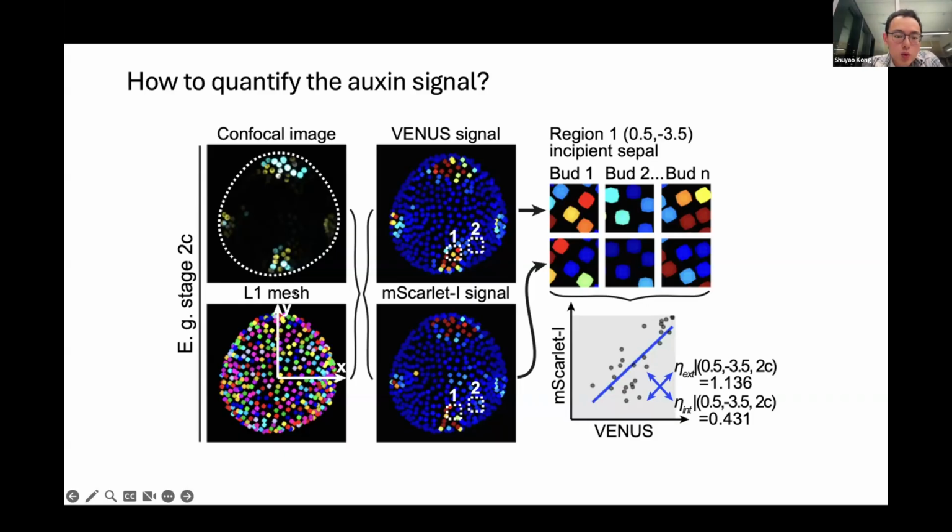You can see here each nucleus is labeled by a little ball, which is a mesh in MorphoGraphX. How we did that: we imported the H2B-TFP signal into MorphoGraphX, and then we did a Gaussian blur. And then we ran an extract local maxima command, which gave us the position of the center of each nucleus. From these centers, we created a ball mesh around each center.